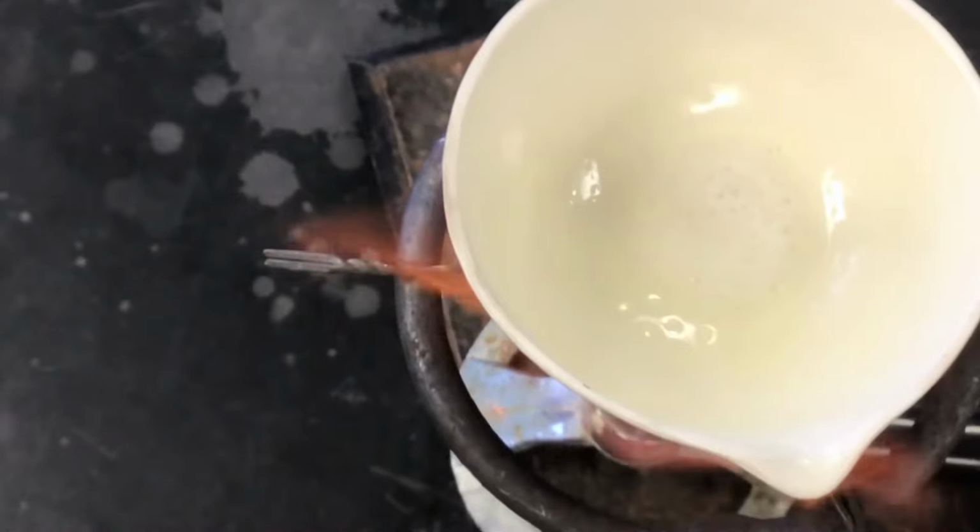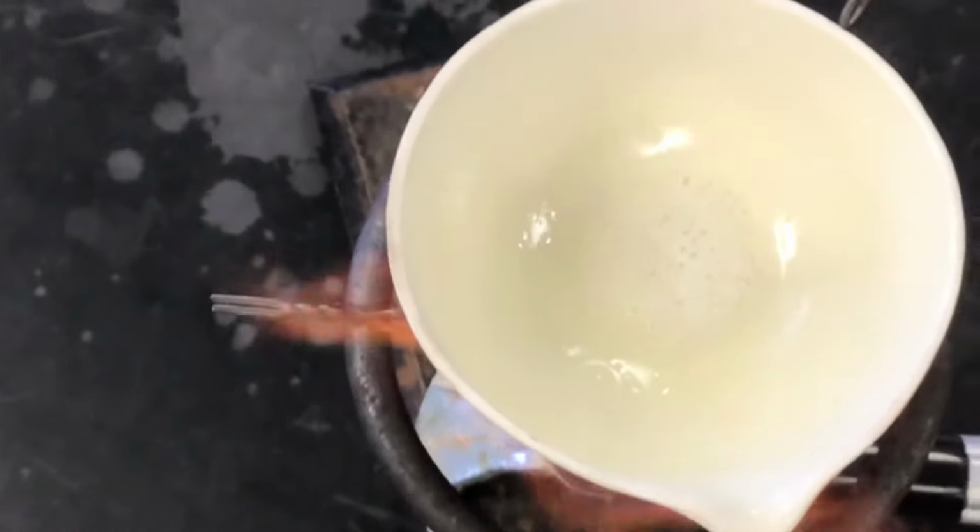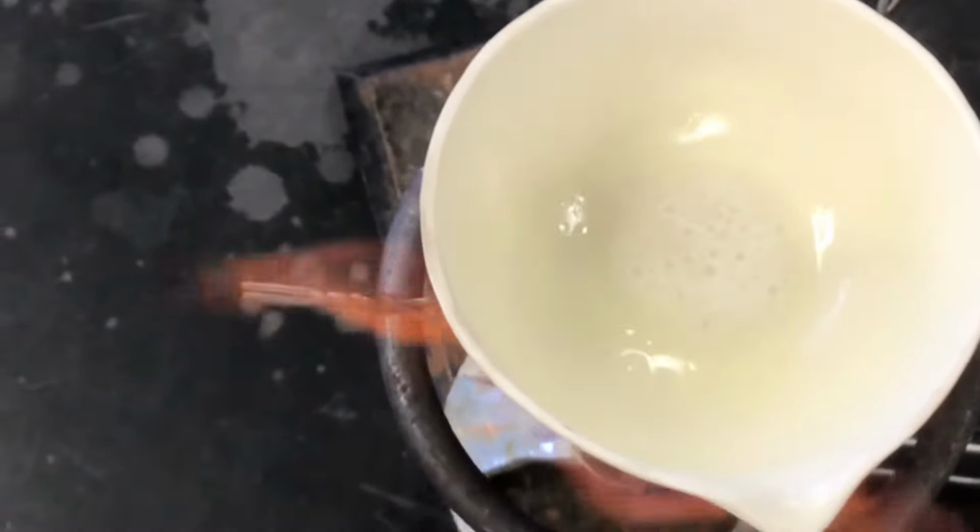There we go. That's speeding things up. Now you can see it bubbling. Really good.